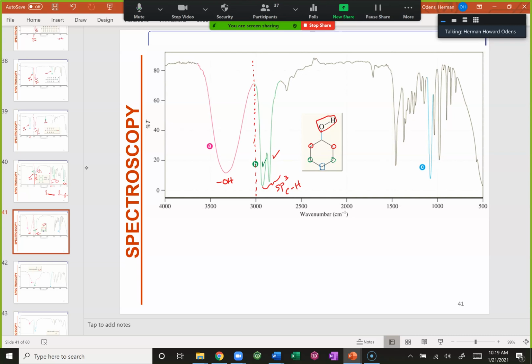Yeah, that makes sense. In NMR, you will see that, yes, we can split this molecule in half, and we will have 3 different signals, and then we can figure out the intensities based on the integrations. Yeah, okay, thank you. You're welcome. But for IR, there's very little that we can assign. So right now, honestly, I can only assign that and those. And then these guys here came grouped up on that big blob, which makes sense because they should be further from the OH group.